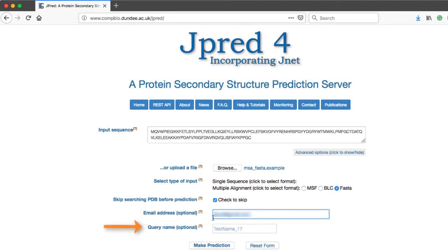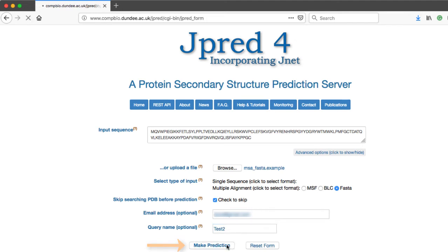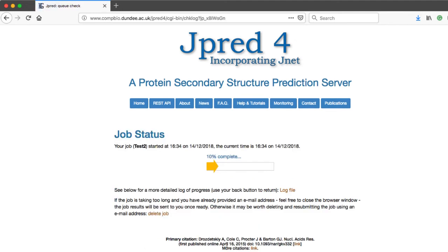The query name is used to identify the prediction. If no query name is given, JPRED randomly generates a name. The query name should be alphanumeric characters. Click the make prediction button on the webpage to submit the prediction.